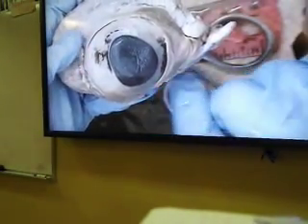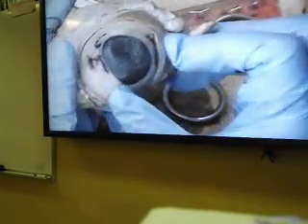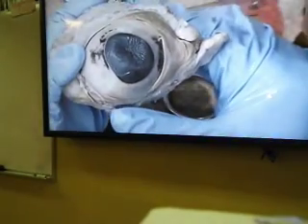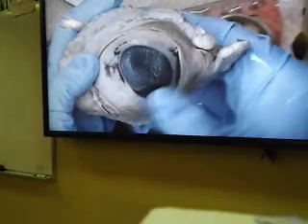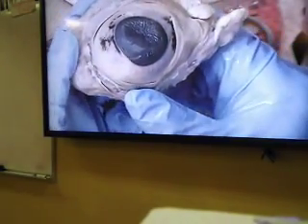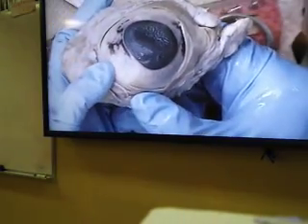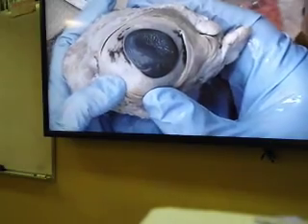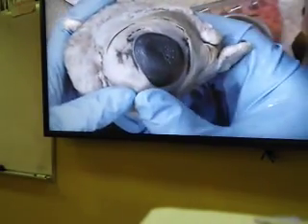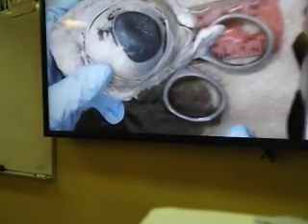So the cornea shows the front of the eye, and surrounding the cornea I see this white of the eye, which is called sclera. Now both of those, since we can see them from the outside, we call outer layer, so cornea and sclera are two structures which are part of the outer layer. However, you can see how hard the tissue is that's making this cornea and sclera, bunches and bunches of dense collagenous fiber, dense regular collagenous connective tissue, making these two structures, sclera and cornea. And that is why we will see it's hard to cut through the sclera when we want to make our first incision to cut the eyeball. So this is why we say these two structures belong to the fibrous tunic. So cornea and sclera are part of the outer layer and part of the fibrous tunic.